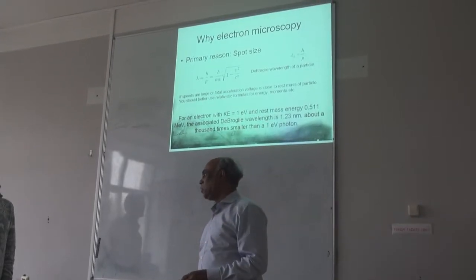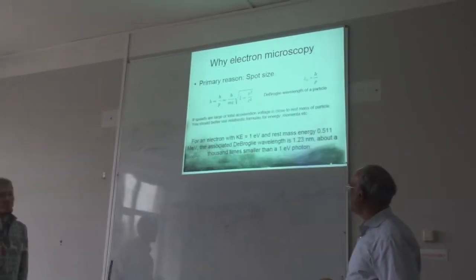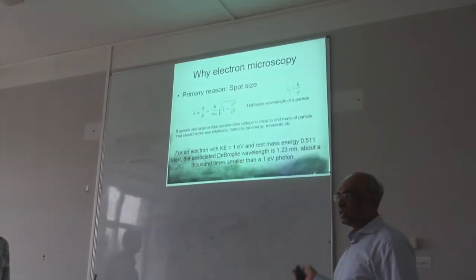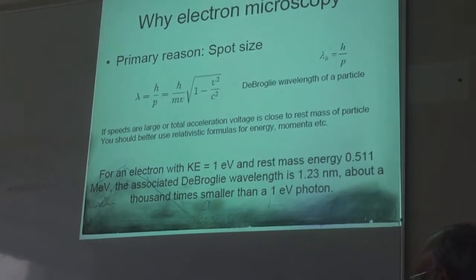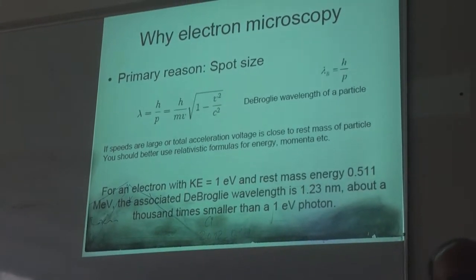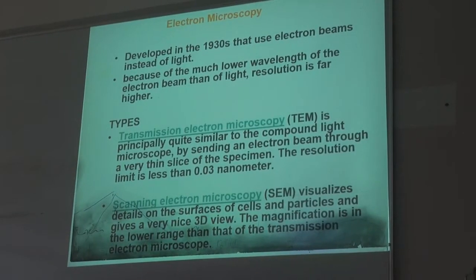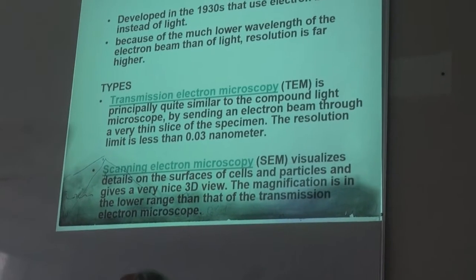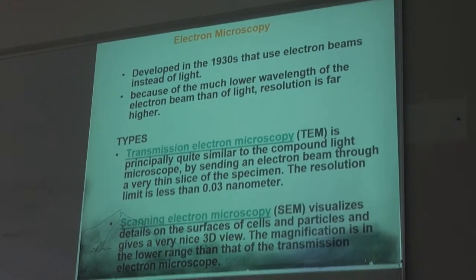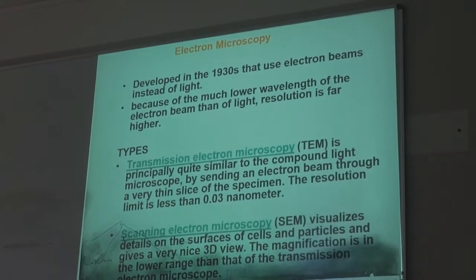Do hundreds of nanometers, right? So that's why in this talk, mostly I'm going to talk about the electron microscope to study nanoscale features. There are two types of electron microscopes. I don't know whether everybody is familiar with this. Everybody knows, right?